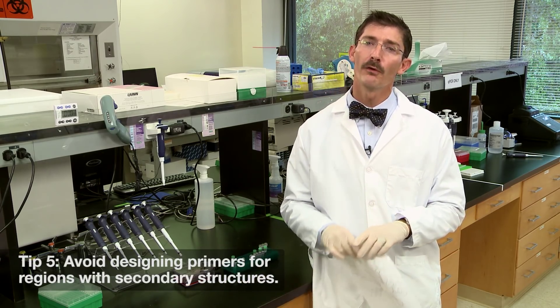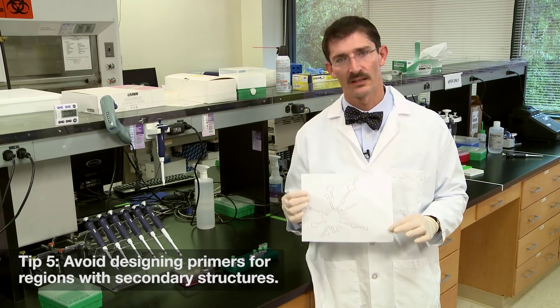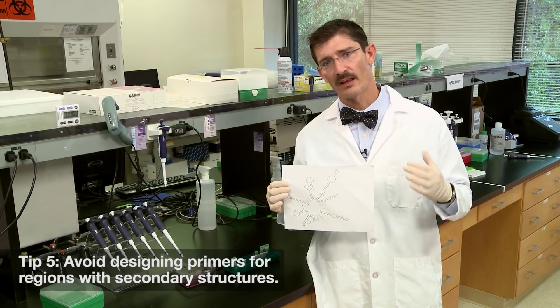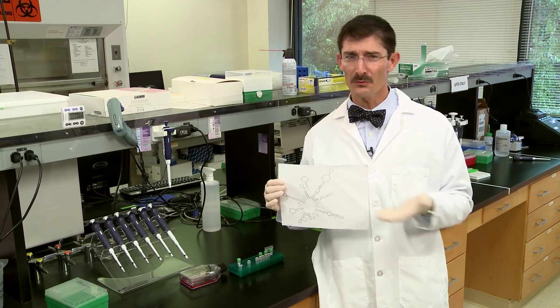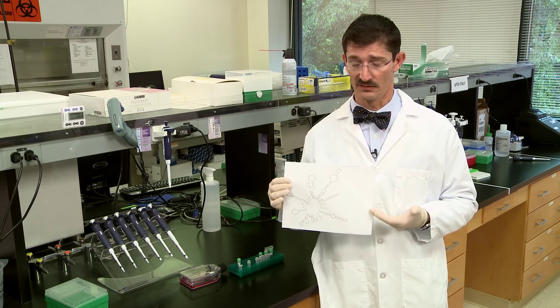Tip number five: avoid designing primers for regions with secondary structures. Use programs like mFold to look for those structures, and if you have to, move your primers. You don't want them trying to anneal to something like this.